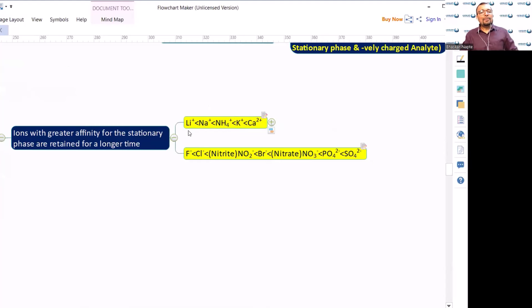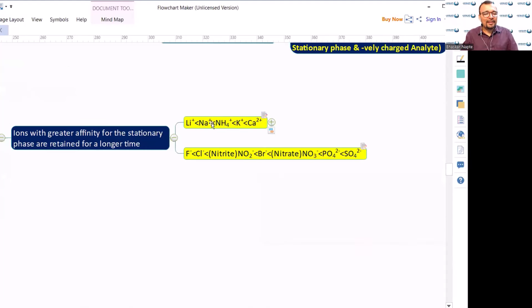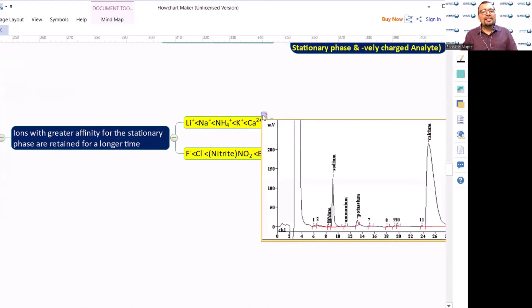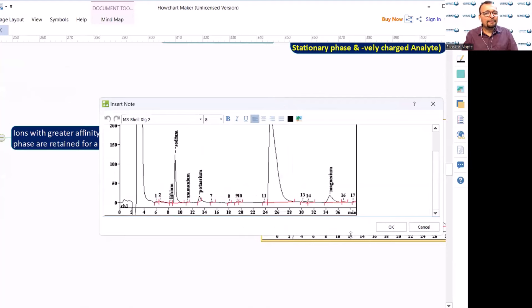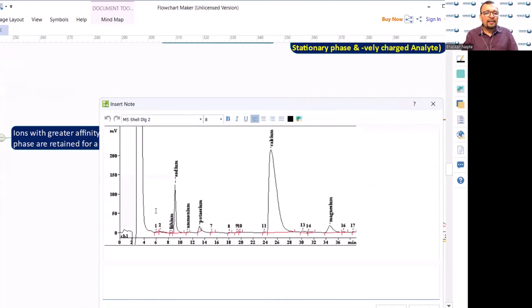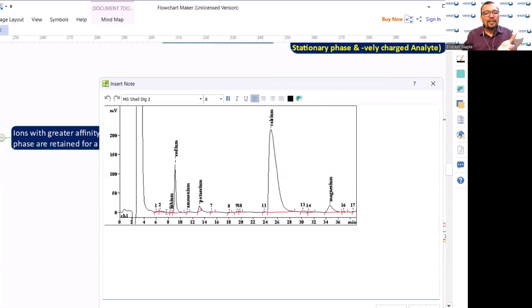Lithium+ has very low affinity towards the stationary phase, followed by Na+, then NH4+, then K+, and Ca2+. Looking at the chromatogram on screen, we can see lithium having a very small peak, followed by sodium, ammonium, potassium, calcium, and then magnesium. This is the retention order.